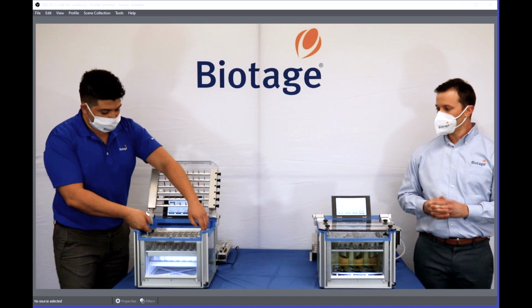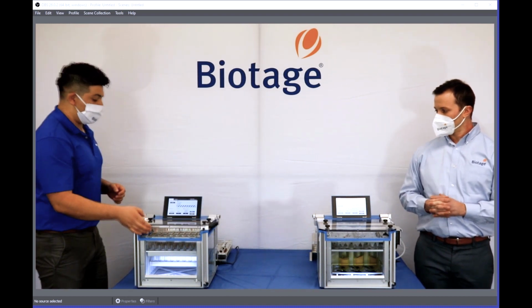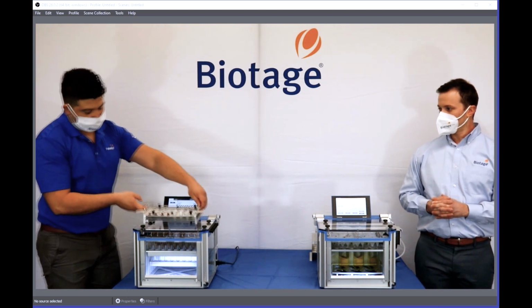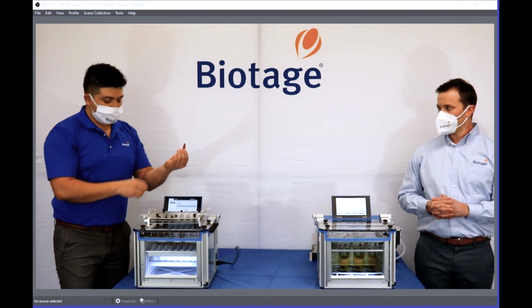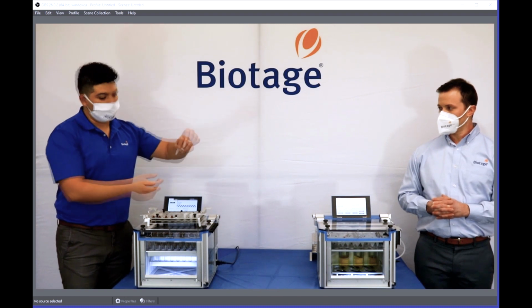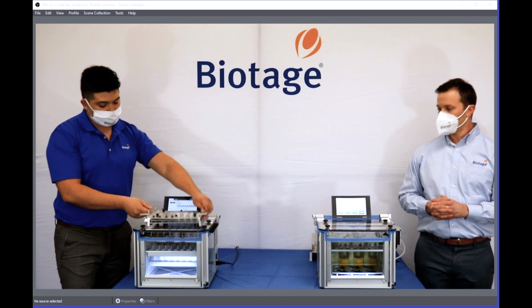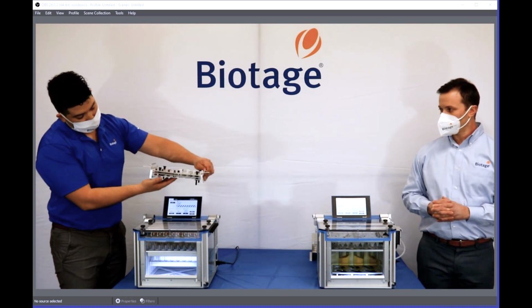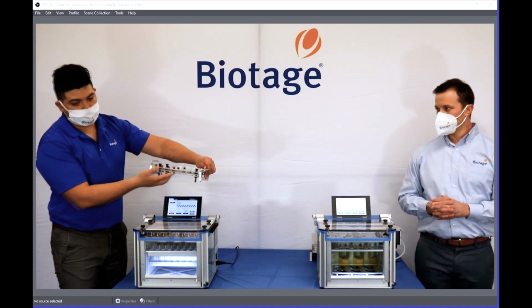Now, in some cases, even a test tube or a filter tube may be too high of a volume, and that's okay. We have a solution for that as well. We have a multi-rack that will fit mini vials. As you can see here, I have a GC-LC vial, or even a microcentrifuge tube that this rack can accommodate, both styles. Similar to the rails that slide up and down, this plate will move up and down to fit snug against the bottom of your vial or your centrifuge tube.